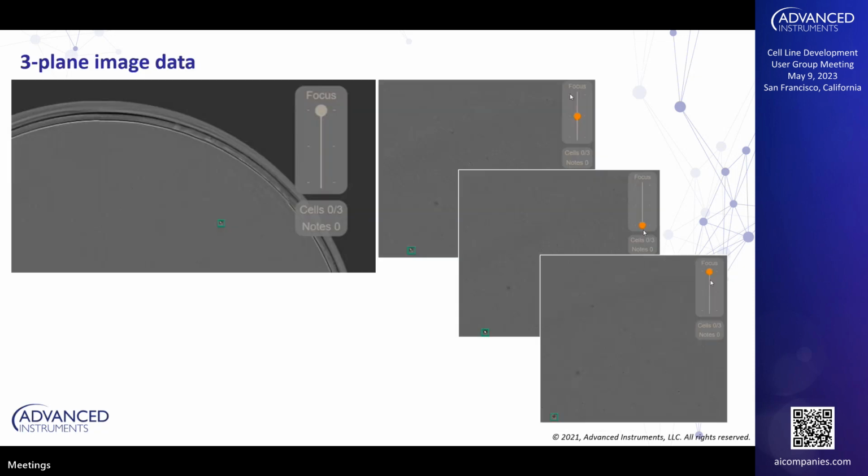Right. And then we've also employed, so I know it's not currently offered on the CellMetric legacy software, but we do have the ability now to go through the Z-stack set of images on the CellMetric X, further assuring the user that what they are seeing is in fact the cell. So you can see as you thumb through the Z-stack of images that the optical properties of the cell are changing, further confirming the suspicion that it is in fact a cell and not a piece of debris or an artifact.